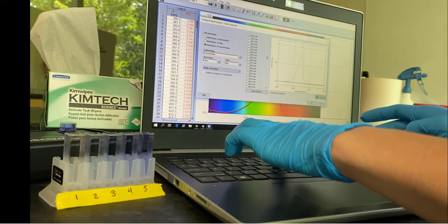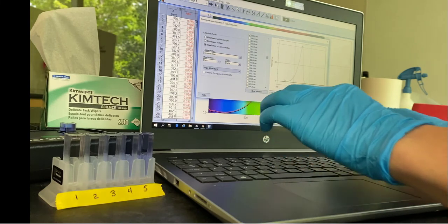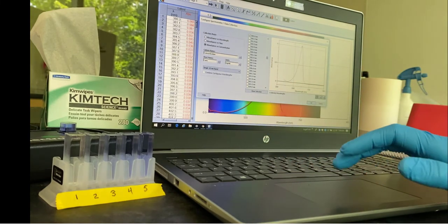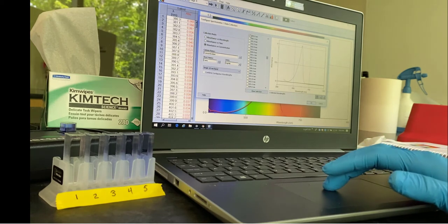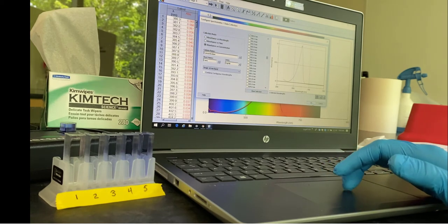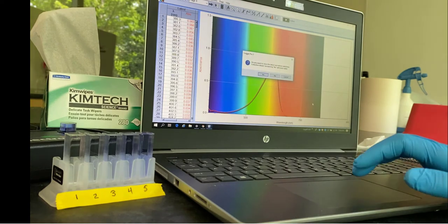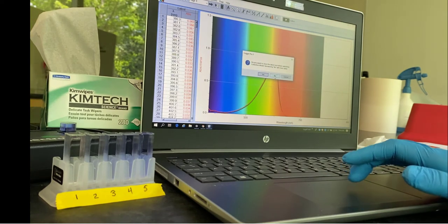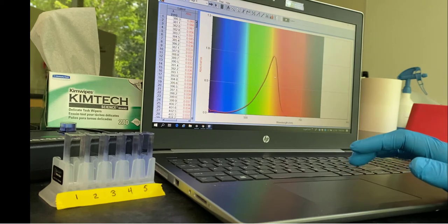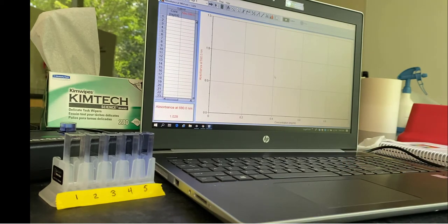I believe it's around 590, can't see the numbers very well. So you're going to see the graph come up and then we'll be ready to generate the standard curve.